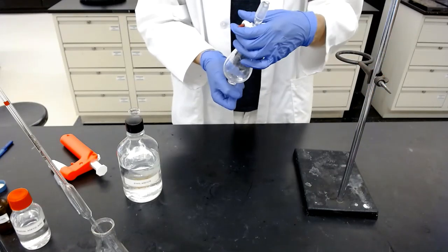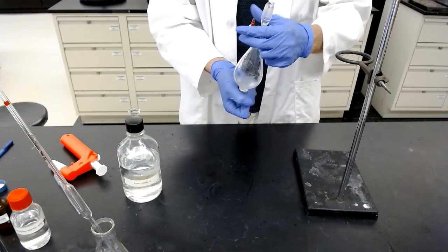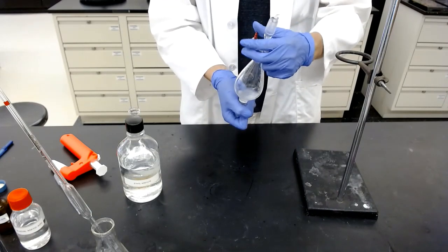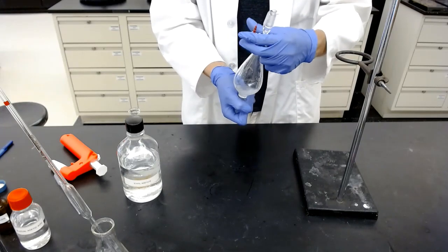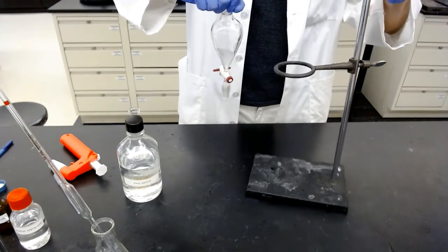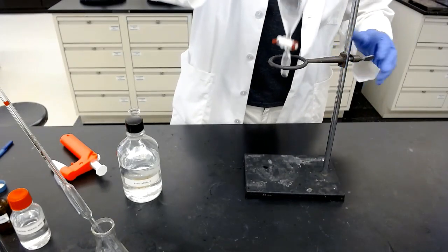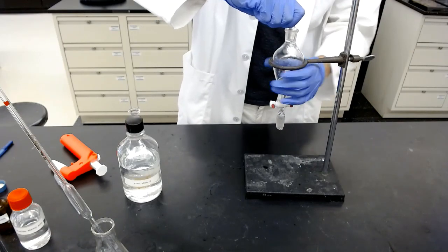We do the normal drill, like extraction. All right. Shake, vent, shake, vent, shake, and vent. Okay. Swirl a little bit, and we're going to let it sit on the ring for settling to see 2 layers.